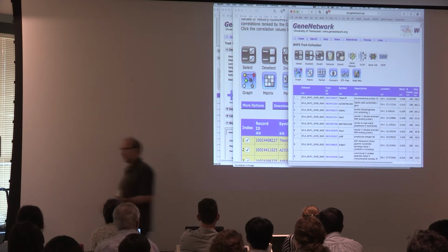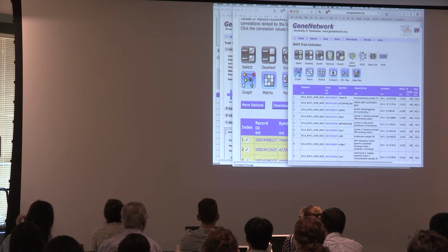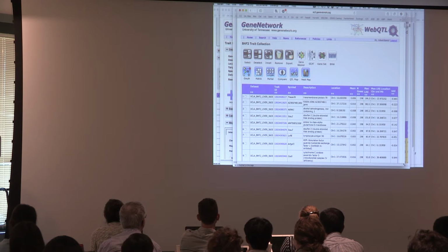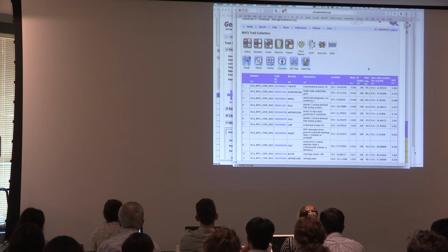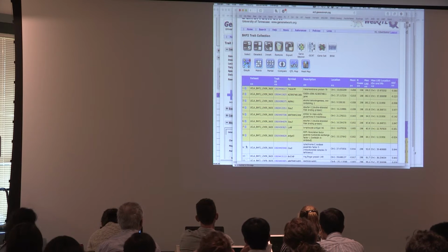I could do kind of fun things that you guys know how to do better than I do now using WGCNA. Obviously, this might be inappropriate for a WGCNA analysis, but we sure as heck know we should see a strong signal on chromosome 1, right? The biggest module we expect here is a chromosome 1 covariance controller module, and the eigengene of this should look just like our marker. Let's do a little bit of that. So I'm going to select just the first 10 of these.